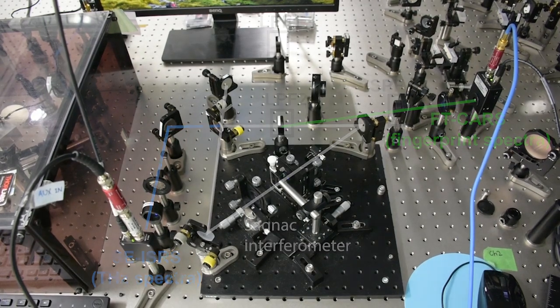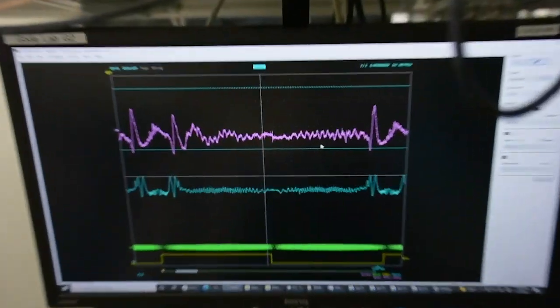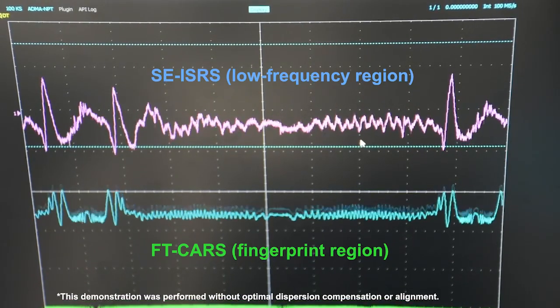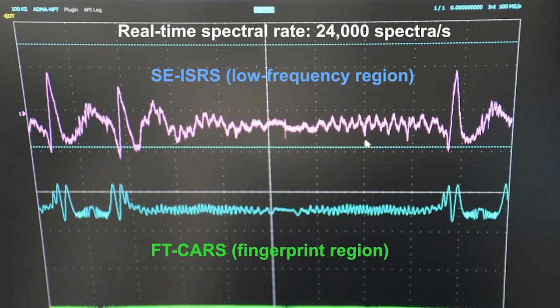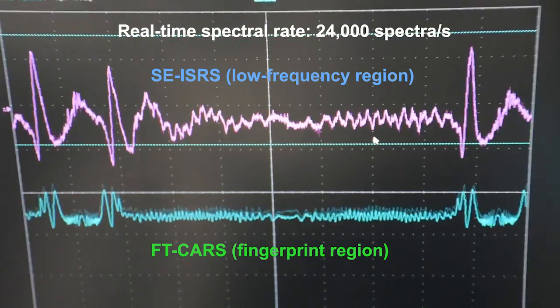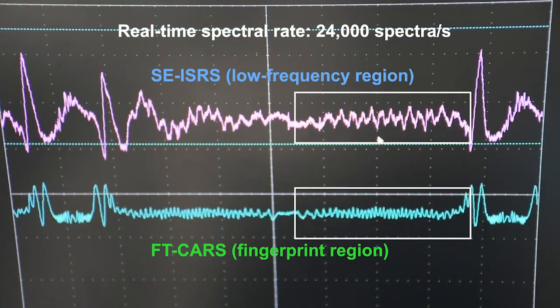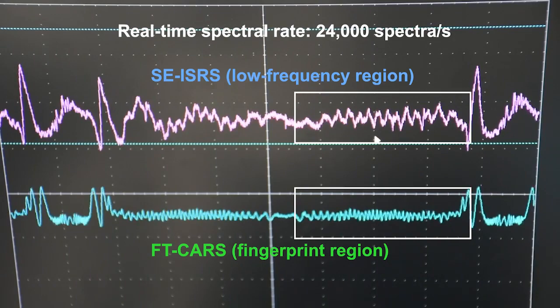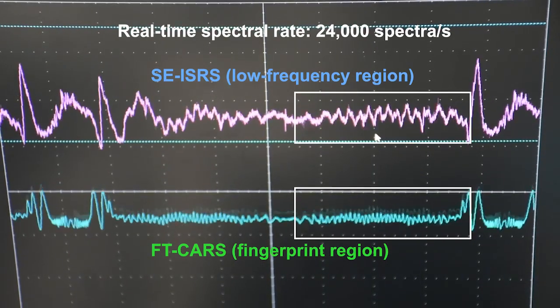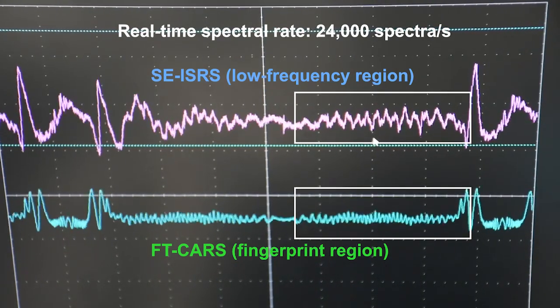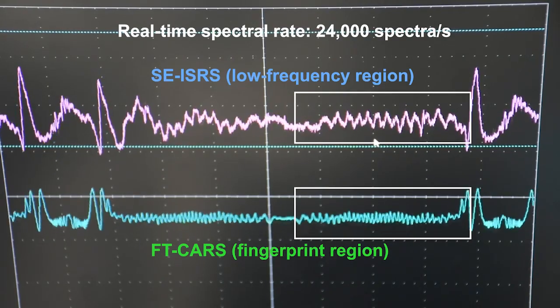Let's take a look at the oscilloscope with a dramatic Hollywood pan and zoom. Okay, these are the two signals of DIVS. At the top is SEISRS, at the bottom, FT-CARS. These are currently being detected at a real-time spectral rate of 24,000 spectra per second. Right away, you can see the dramatic difference in sensitivity to the detected Raman mode frequency. The top displays the lower frequency Raman modes, the bottom the fingerprint modes. This really is the strong point of DIVS.